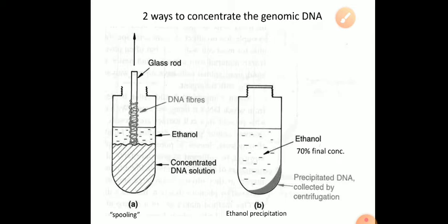And then what you have to do is purify the DNA, separate the DNA. You have to separate out the DNA by using cold ethanol. So once you have added RNase enzyme, you now add to the same tube cold ethanol, minus 20 degrees Celsius. Cold ethanol can be added.